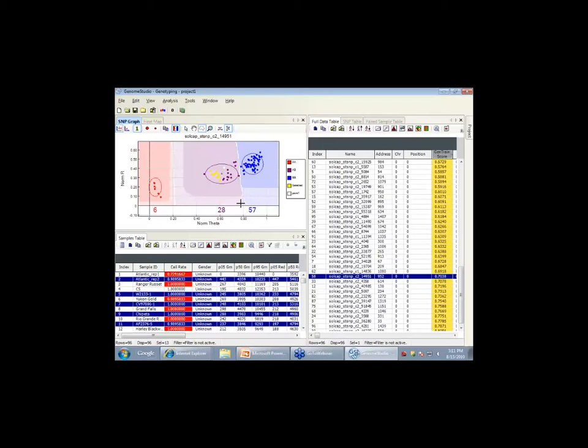Think about this in the context of clusters: if you see different clusters that are not highlighted here, you can highlight the clusters differently. But right now I'm highlighting samples, not highlighting SNPs. So those clusters will change with the different doses of those SNPs, of course, for different SNPs. It also highlights in the sample which samples I've highlighted.